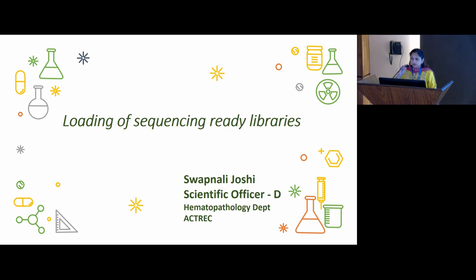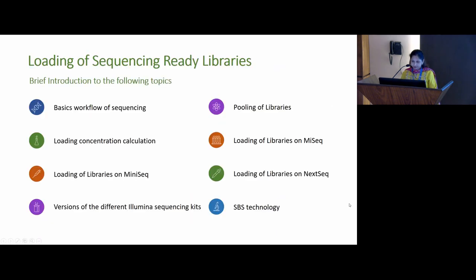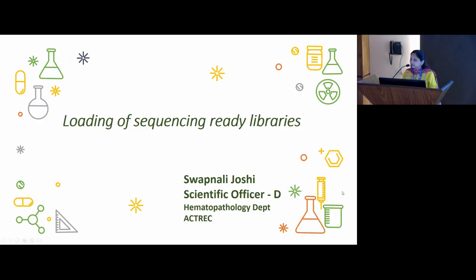Both address different things. Qubit is only for quantitation. TapeStation is only to assess the quality of the library. If you want to see the spread of your library, whether it is proper or not, whether there is any adapter contamination, for all that you require TapeStation. Both address completely different things. TapeStation we never use for quantitation. Qubit we never use for quality. It's only for quantity of DNA.